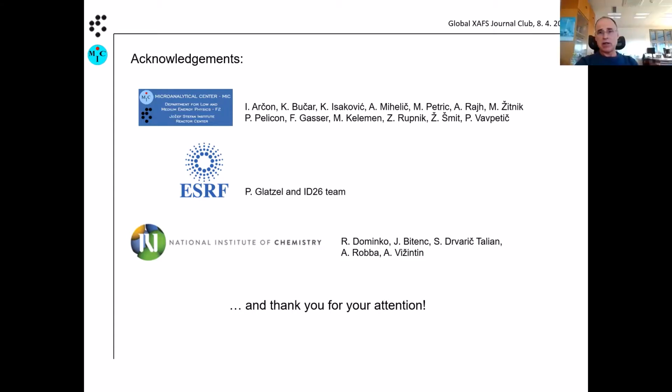Yeah, but I would also personally like to go to smaller radius. One needs to try. How large is this effect? Like you say, you can always mask a bit, but generally we also work sometimes with a very large source, and it doesn't make a huge difference. We have worked, for example, at ELETTRA, a bending magnet beamline, on a gas. We have taken really a full beam, this was so wide, and there was not a major problem. But of course, we use Johansson for that purpose.